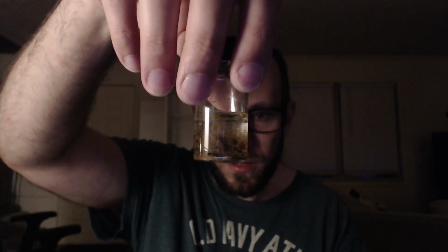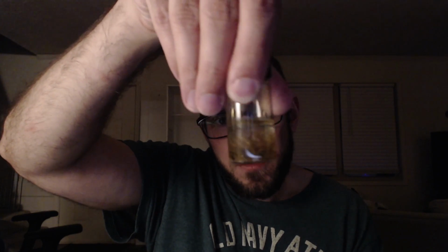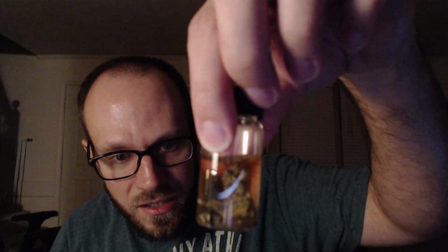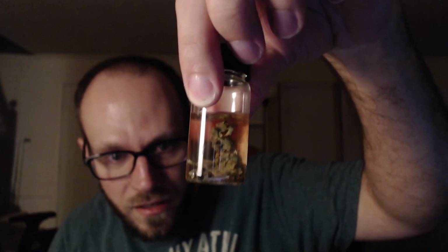This sample I took a few weeks ago from North Carolina. It's got a bunch of diatoms in it. I haven't made a new slide from it in a while, but honestly, there's nothing that I see that could be photosynthesizing, so everything in here might have died. We'll see. But yeah, just get a small piece of organic matter and some water, and you're golden. I'm going to keep this one for a while and see what it does. I'm guessing the water will turn clear, and eventually the bacteria will die, but that object in there is a lichen that I took off of a tree.